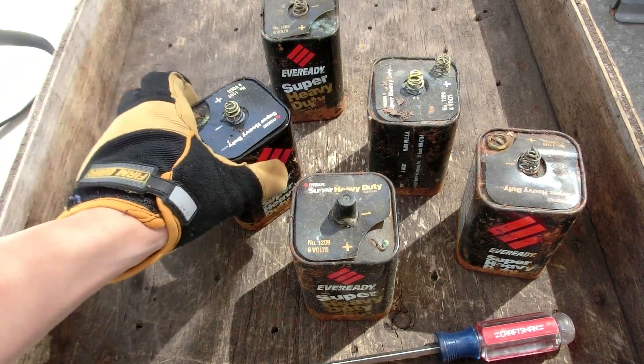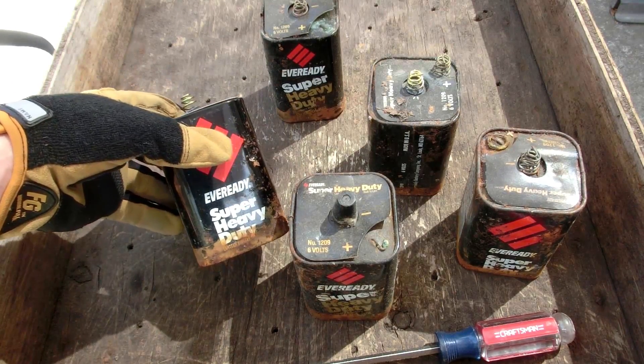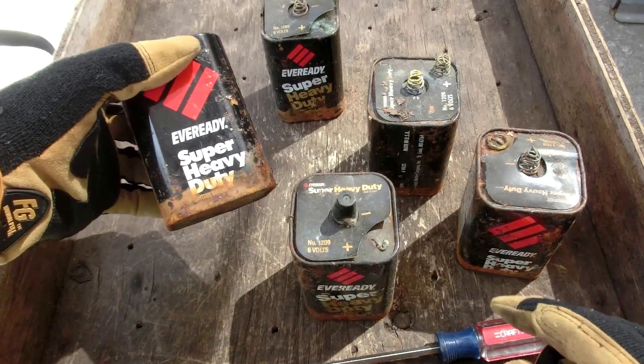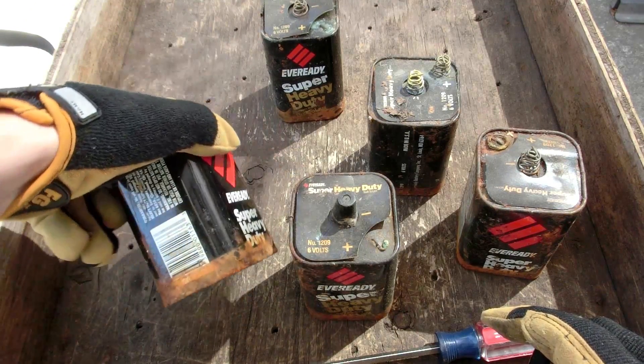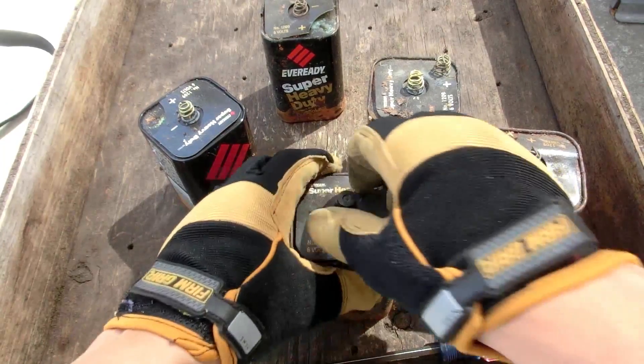So yesterday I was cleaning up the shed at my new place and I found these old six-volt batteries. They say super heavy duty on them and they do not seem to say alkaline battery on them. So I'm thinking these are probably carbon zinc batteries.